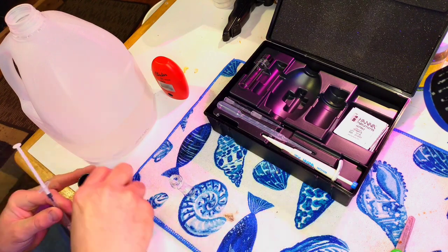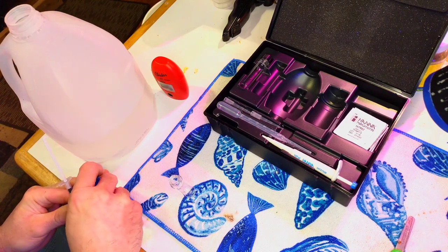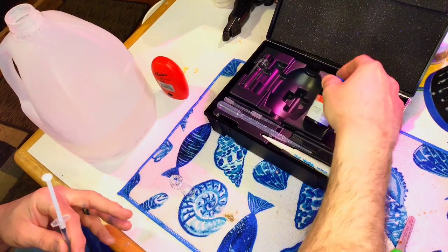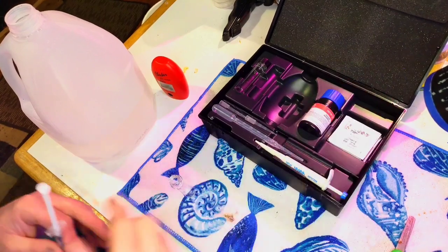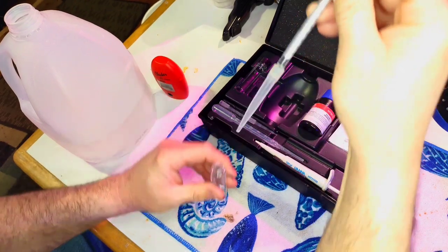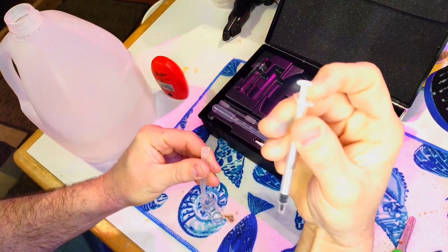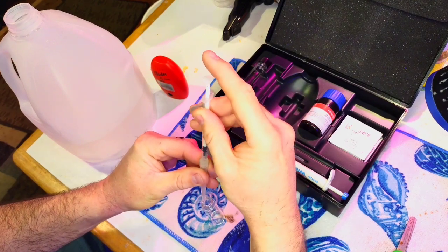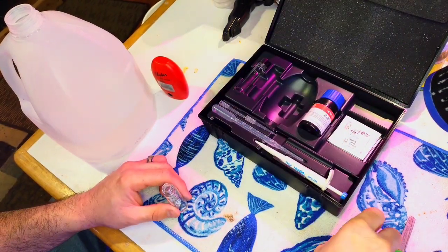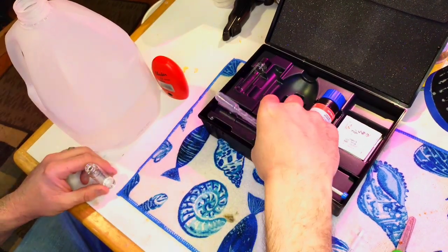Cap your reagents when not actively using them — I've spilled them before and even got some on my hand just now. These reagents are close to 30 dollars, so you don't want to knock them over. Put in your one milliliter: if there's a little bit left in the syringe, take the adapter off, pull up the plunger, put it back on, and push it down back into the vial to get it all out. Then fill the rest up to the 10 milliliter mark with distilled water.